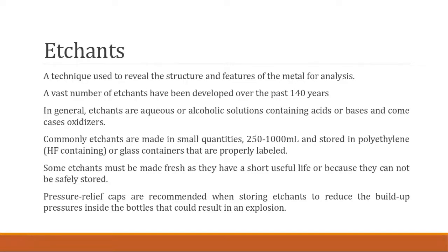Some etchants have to be made fresh, either because they have a short useful life or because they cannot be safely stored. It's nice to have pressure release caps on stored etchants to help prevent the buildup of pressure inside some of these bottles. Enough pressure can shatter glass, and hence an explosion can occur. And if you're nearby, not only do you get hit with shards of glass, but you also have the chance of getting hit with the chemicals that were within that container.